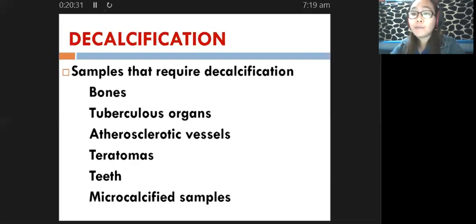Say, for example, we consider the recommended staining procedure for histology. Again, what's the recommended staining procedure for histology? Yes, very good. It's good that you can still remember. We have the H&E staining technique. The basic dye incorporated in H&E staining is, of course, hematoxylin. So if you perform decalcification, there is a probability that hematoxylin may be inhibited. I repeat, the action of hematoxylin may be inhibited.